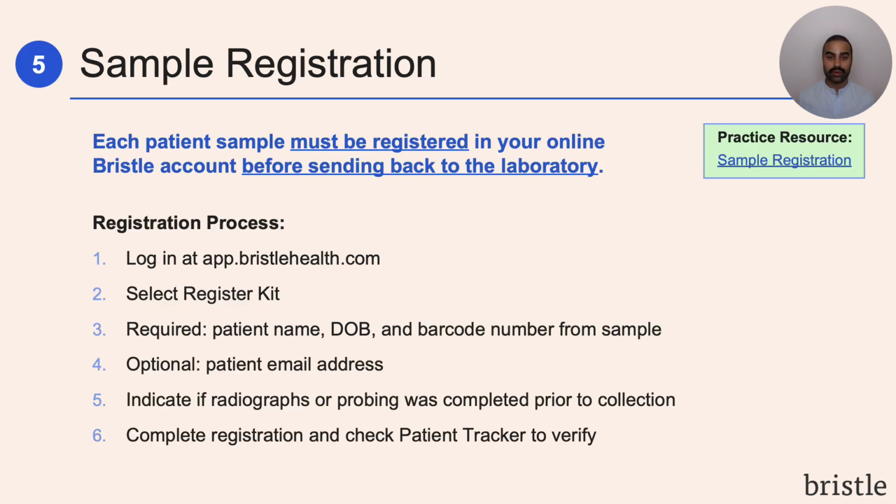After collecting the sample, the next step is to register it in your online Bristle account before you ship it back. This is a very critical step because if the sample isn't registered, we won't have any idea who it belongs to and you won't be able to access the results. So it's a very simple process.